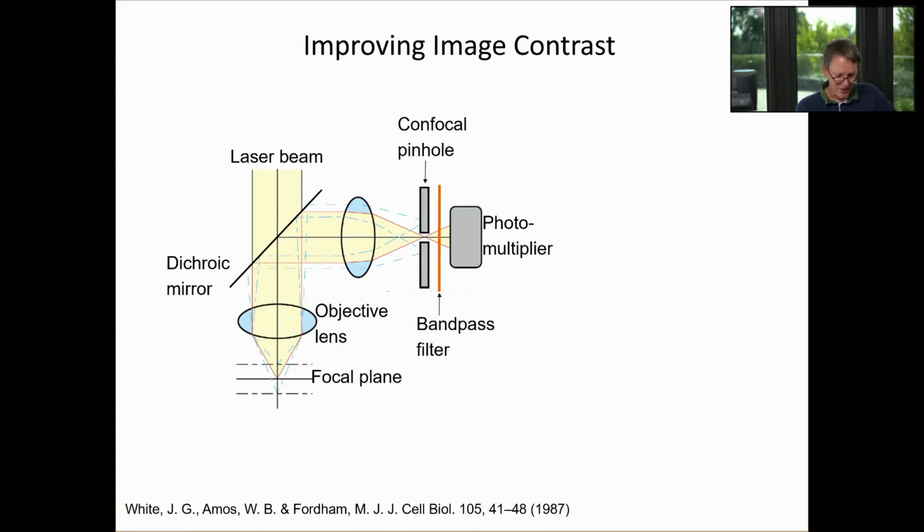And so what you do is you have a laser beam. The laser beam illuminates a sample like that, and then you focus the light onto the sample, and the fluorescence that you excite in this point in the sample travels back, bounces off a mirror. It's color shifted, as you remember from the discussion of fluorescence. And then you have the tube lens here. This is the tube lens, and the image of this point that you illuminate is imaged onto what's called a confocal pinhole.